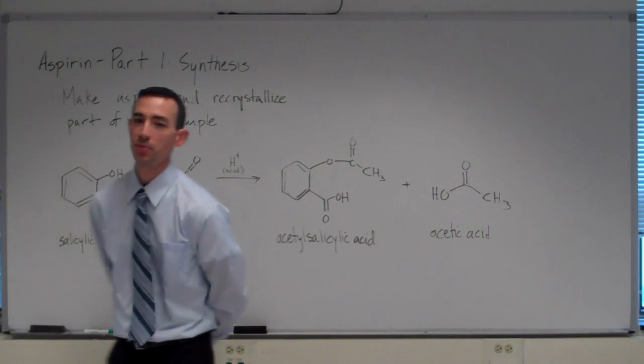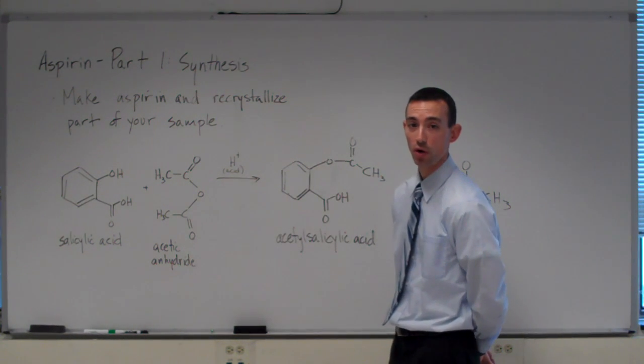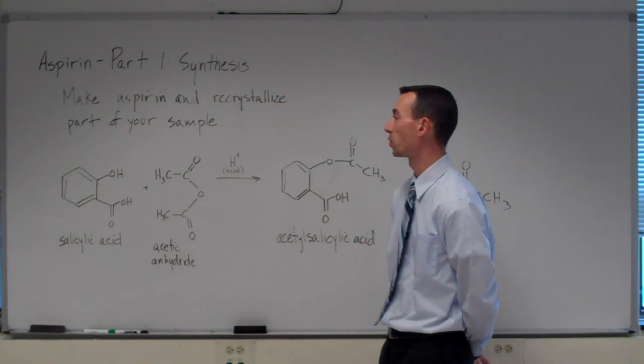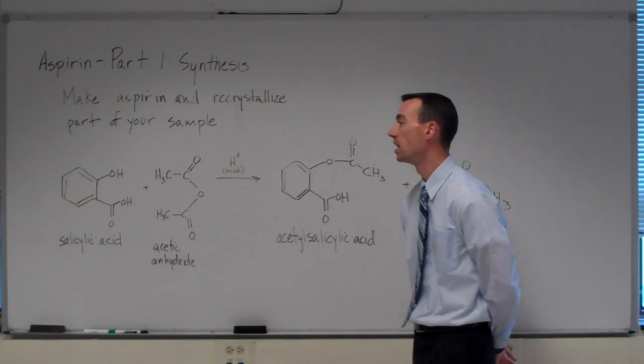The goal of the aspirin experiment, which is Part 1 today of a 3-part experimental sequence, is to make a sample of aspirin and then to recrystallize a portion of that sample. We'll talk about what that means in just a couple of minutes.